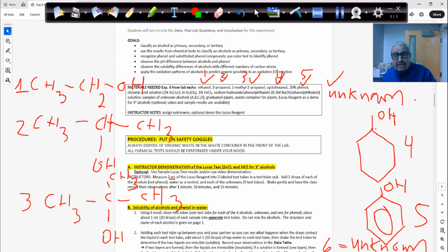But anyway, they are giving us 5 for alcohol: 1 is cyclohexanol, cyclic alcohol, and 1 aromatic alcohol called phenol. This is cyclohexanol without the loop. The loop is phenol. And then our unknown. All the time, take how many? 6. Whatever says 8, 9, 10, 5, 3, no. All the time 6, because you have to be consistent in order to get your unknown correct.